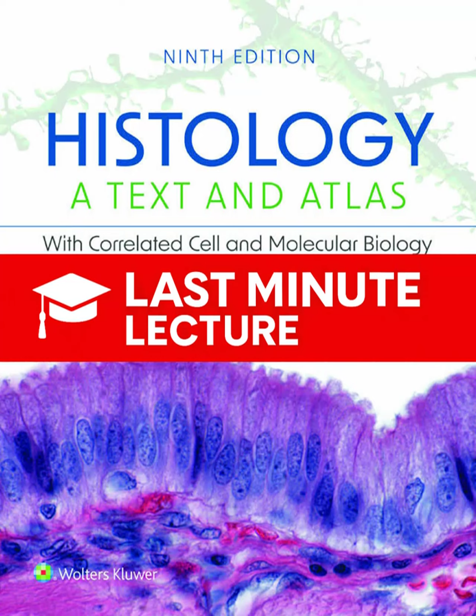The textbook gives a classic example of this from cell biology history, using acid phosphatase activity to identify the lysosome. That's a fantastic example. In a lightly fixed tissue, you expose the section to a substrate that the lysosomal enzymes can break down. The reaction mix also contains lead ions. And the lead ions are the trapping agent. Exactly. As the enzyme works, the lead ions trap the product, forming this electron-dense lead phosphate precipitate. Seeing that precipitate inside these little vesicles confirmed the existence and the function of the lysosome.